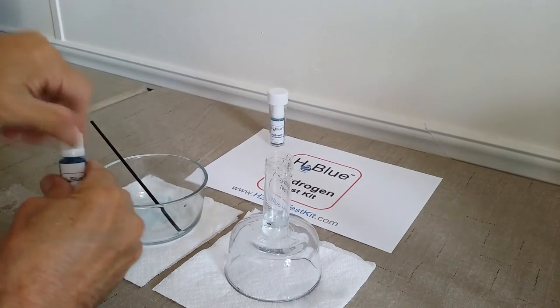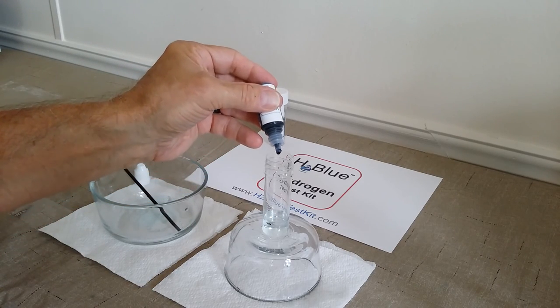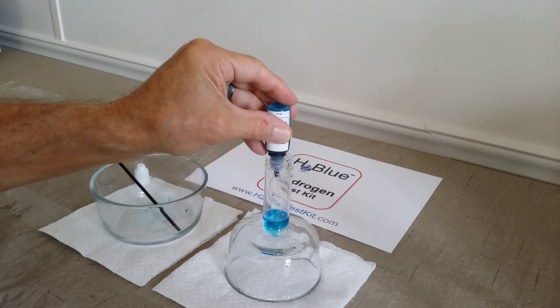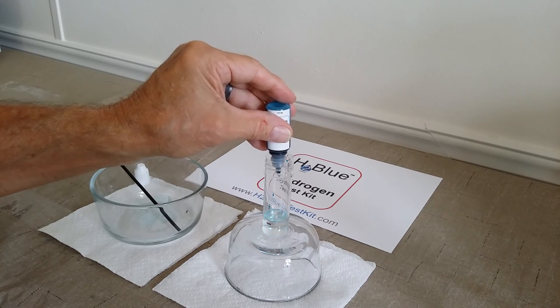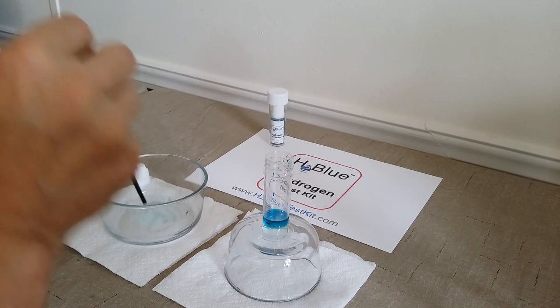And then we will start dropping drops in. Each drop, remember, represents 0.1 ppm of hydrogen. At first, I can drop quite a few drops. 1, 2, 3, 4, 5, 6. You can see that they're disappearing, so I know I'm not even close yet. 7, 8, 9, 10, 11, 12. I'll stop there, and I will gently stir.